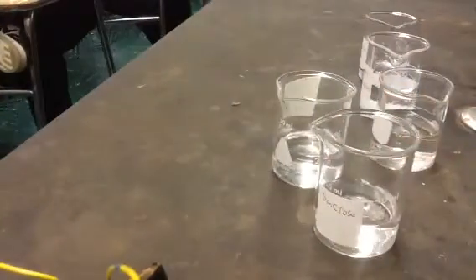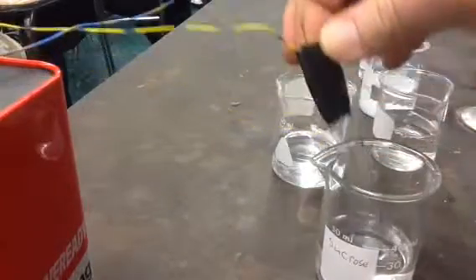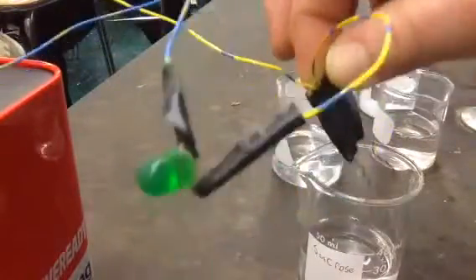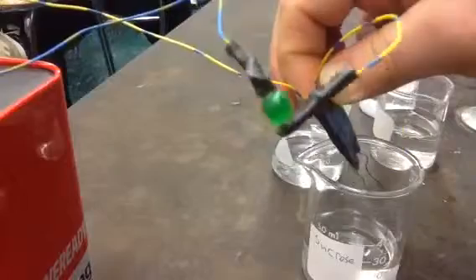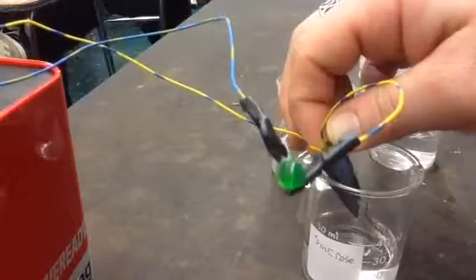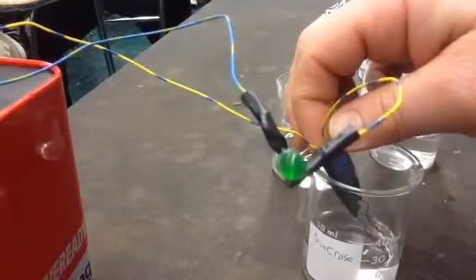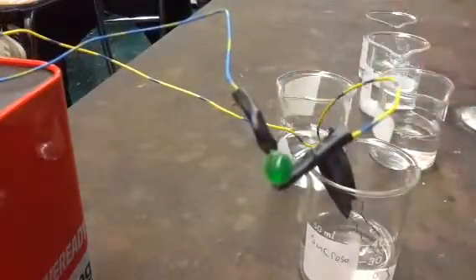So now we'll go ahead and we'll go to the sucrose. And I'm going to stick the ends of the probes in the sucrose. Nothing. Not lit. Into the sucrose. Still not lit. Sucrose is non... Did that just light? No. Okay. It looked for a minute on film like it lit, but it did not. Okay, so we've got sucrose non-conductive.